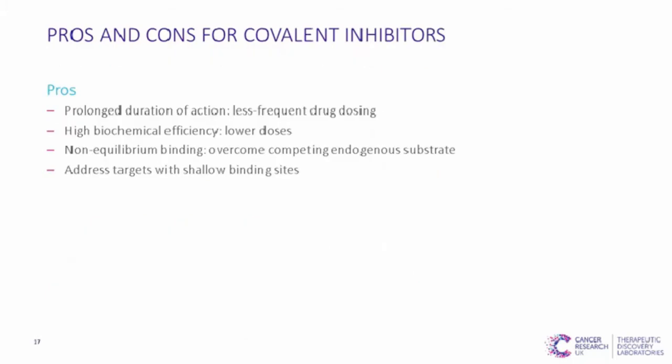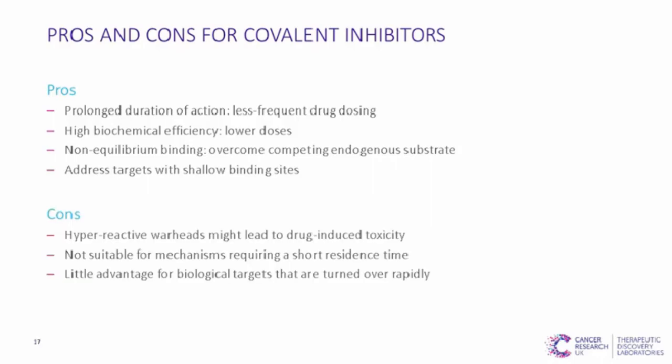These include prolonged duration of action, which results in less frequent drug dosing, high biochemical efficiency, which results in lower doses, non-equilibrium binding, which allows us to overcome competing endogenous substrates, and it also gives us the possibility to address targets with shallow binding sites. Against that, a hyperreactive warhead might lead to drug-induced toxicity. Covalent strategies are not suitable for mechanisms requiring a short residence time, and little advantage has to be gained for biological targets that are turned over rapidly.